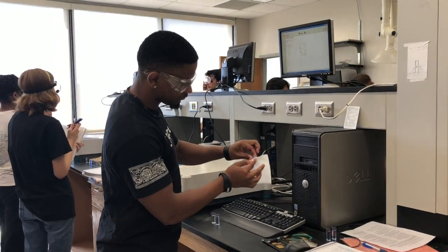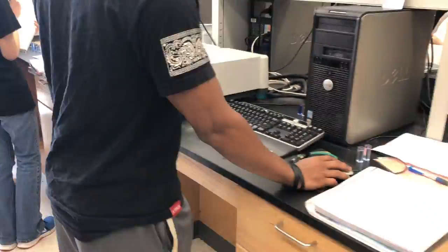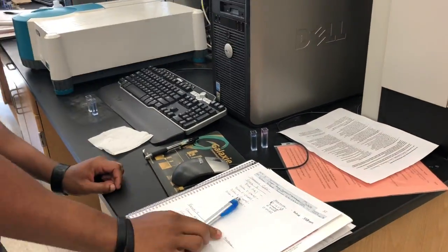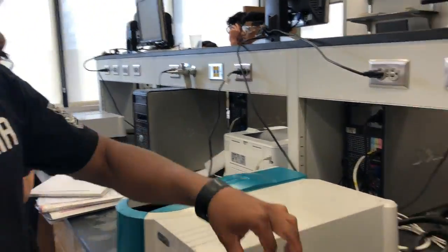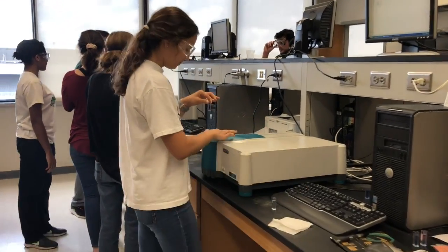Each group member used the spectrophotometer to scan at least one sample, and they recorded the absorbance. We only had to zero the machine once. We scanned and recorded the absorbances for 4 different samples.